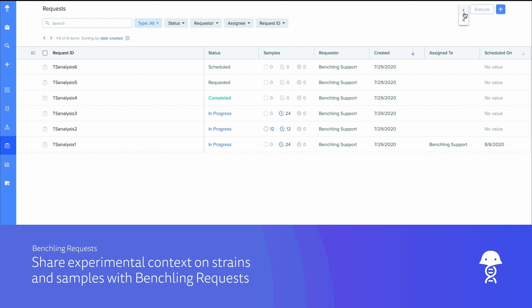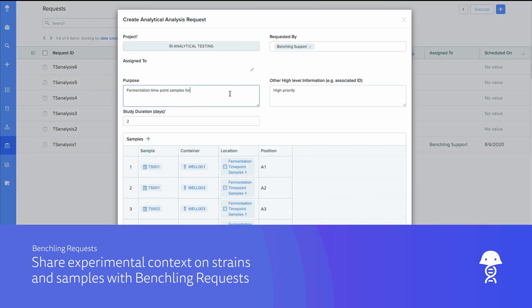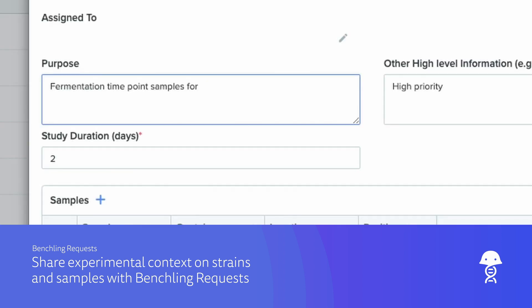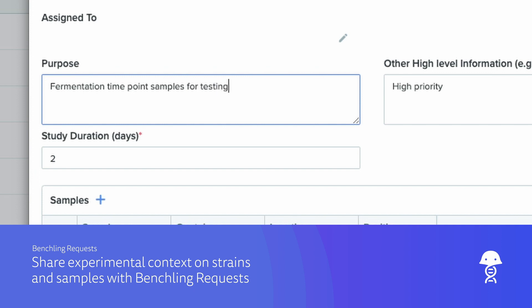Manage and streamline your organization's request fulfillment. Share relevant strain and sample information. And forecast for upcoming tasks.